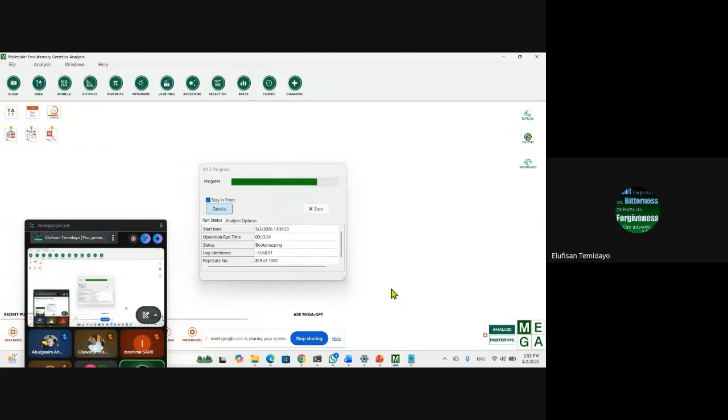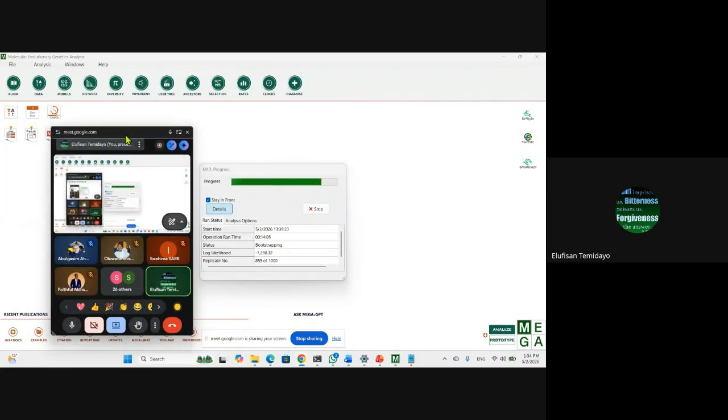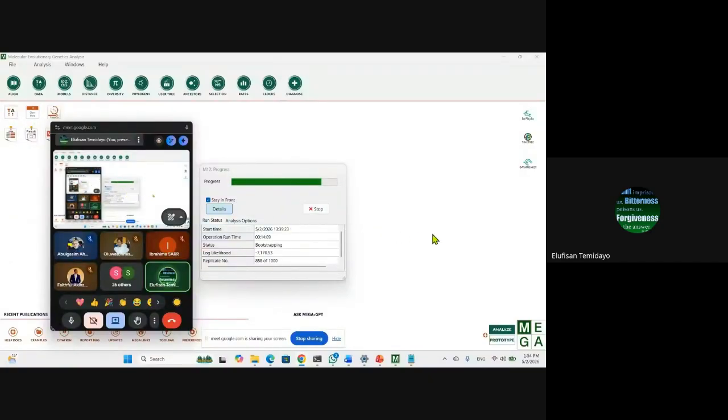That's why I said sometimes we are working with a lot of sequences. You have to use other tools, but those tools are terminal based. Like IQ-TREE is terminal based. It's not what we can download like this and work with. You have to work on it on Linux, WSL, or a Mac. So that's why when you're working with a lot of data, it's better you work with neighbor joining. We will see that the difference is usually not too much. We will see once it finishes this. So that's about that on phylogeny.